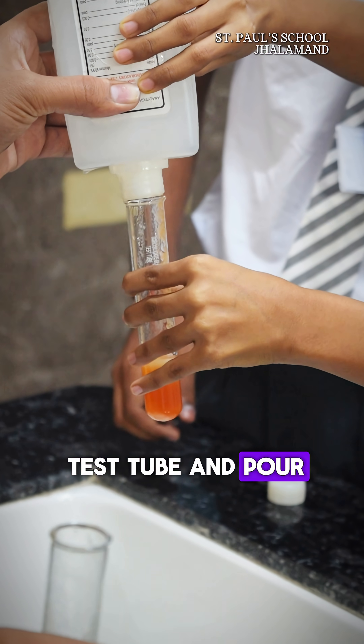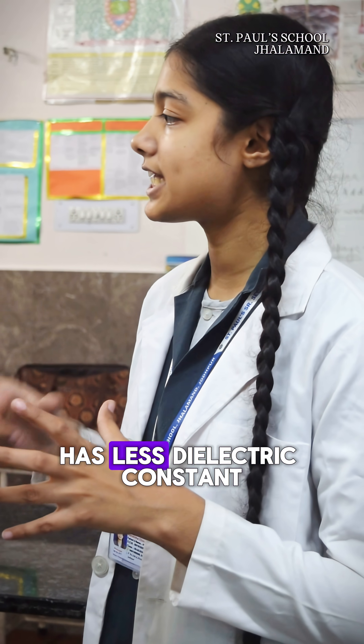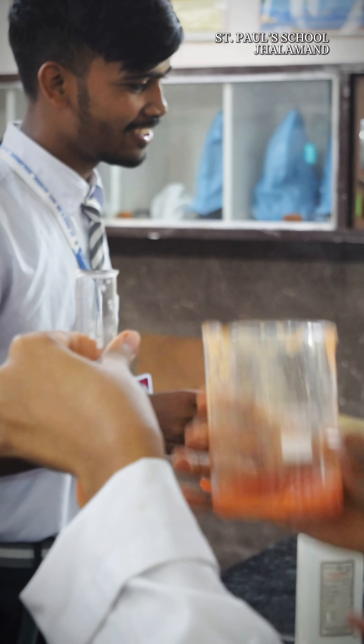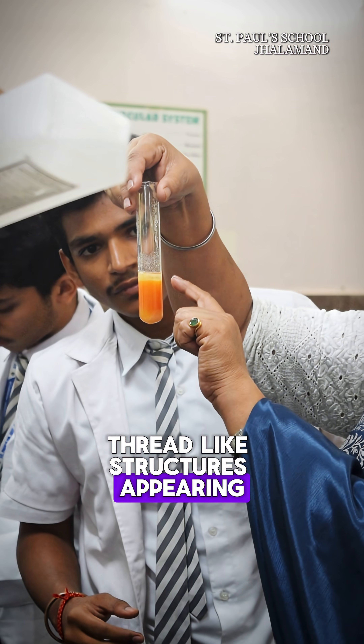Next, we filtered this into a test tube and poured chilled ethanol. Why are we using chilled ethanol? It is because chilled ethanol has less solubility, and after a few seconds we could see white thread-like structures appearing between the two junctions.